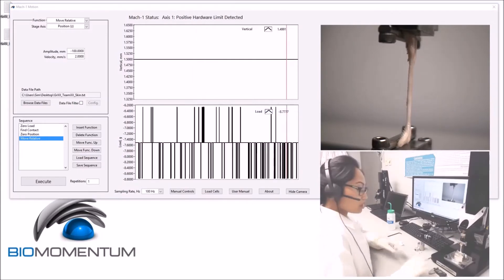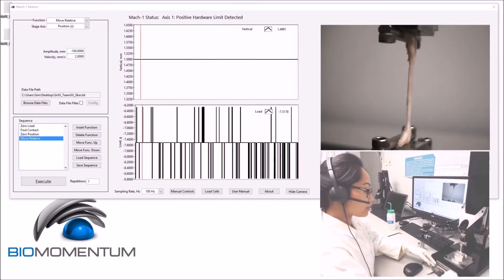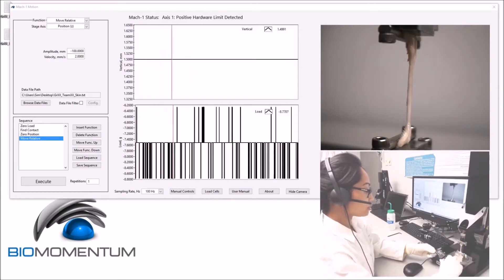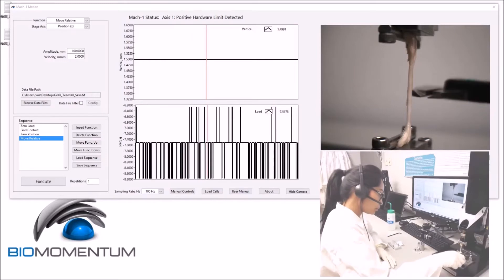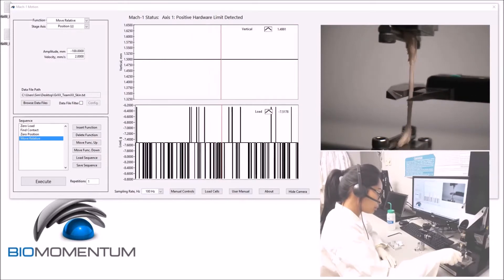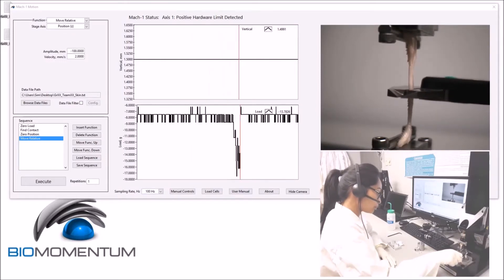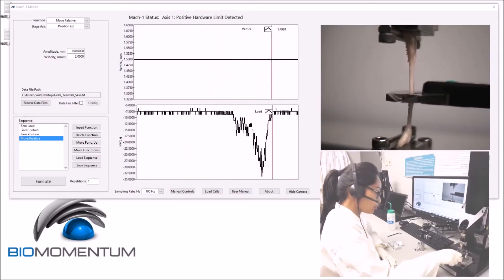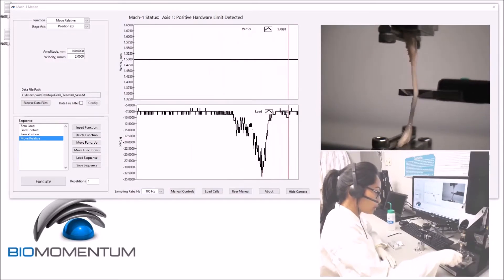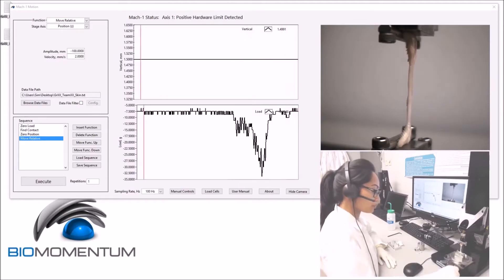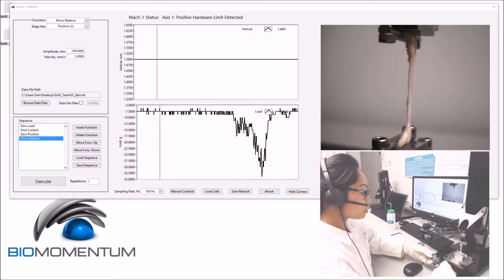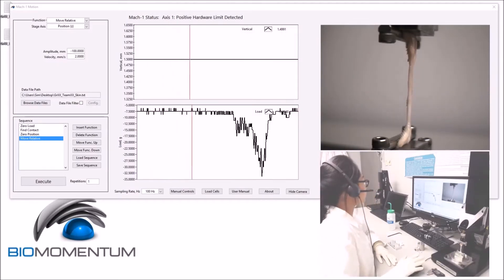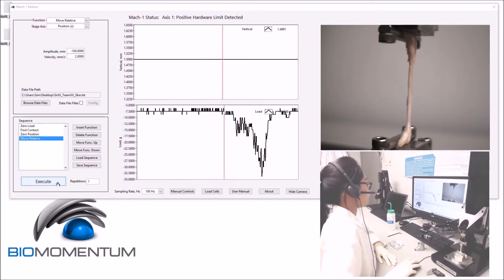Measure the sample thickness using a caliper. 1.40 mm. Report the value and press Execute.